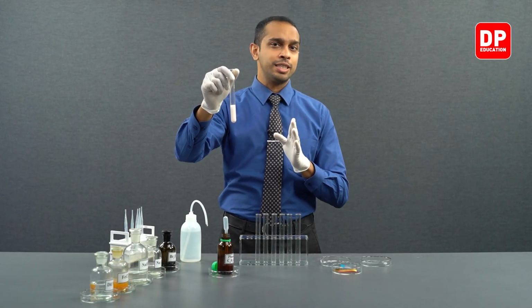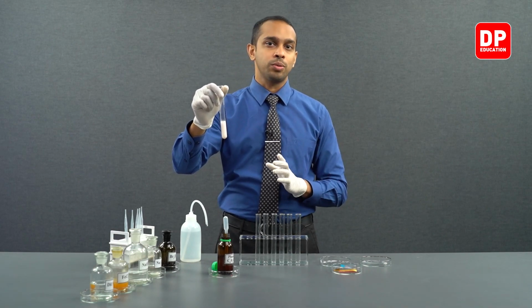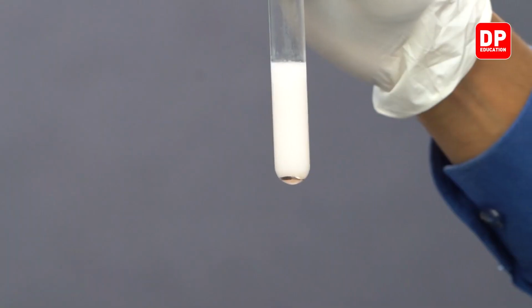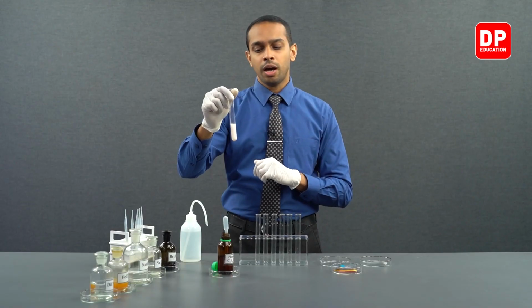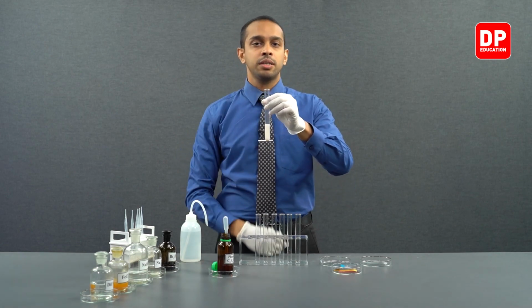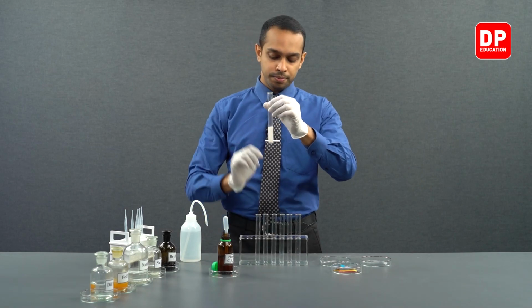Now, this is due to the presence of the OH group connected to the benzene ring. This allows phenol to be moderately soluble in water. Now, let's check the pH of this mixture.